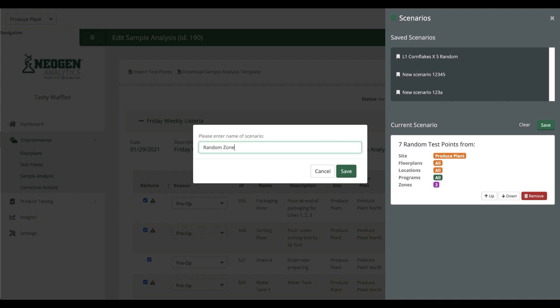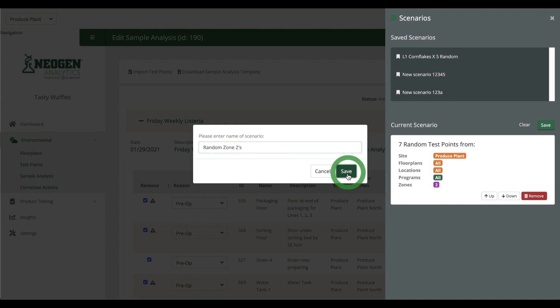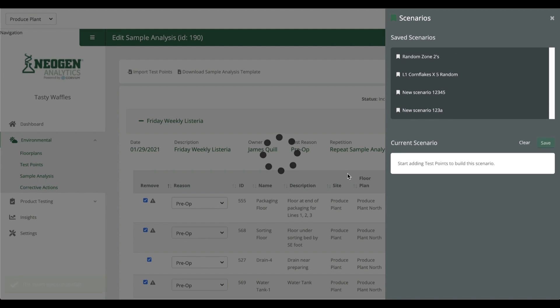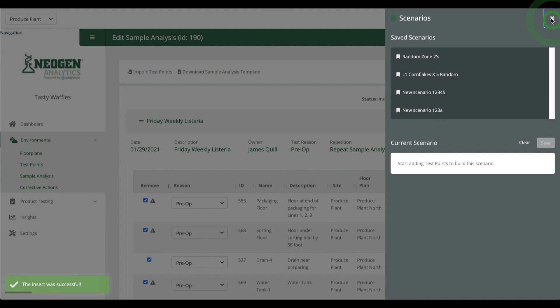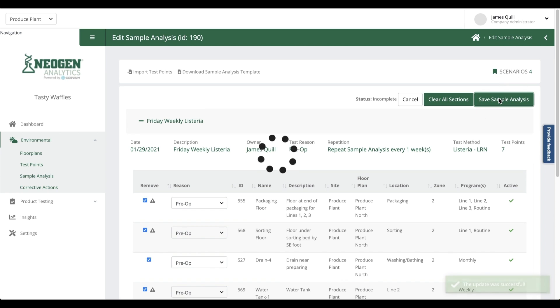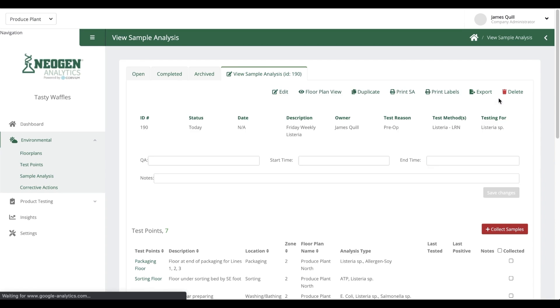Now, my tech is going to come in and collect their samples this week, which is great, but next week is really what's exciting. Because next week, a sample analysis is going to generate automatically containing 7 random Zone 2s that need to be swabbed for Listeria, and I didn't have to do anything else to make that happen and get into my workflow.